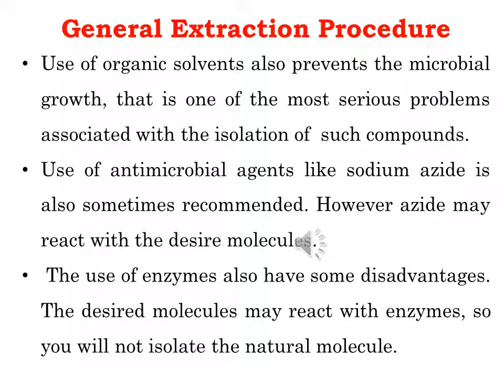Use of organic solvents also prevents microbial growth, one of the most serious problems associated with the isolation of water-soluble compounds. It is imperative that all isolation work be done in a cold room. Use of antimicrobial agents such as sodium azide has sometimes been recommended.